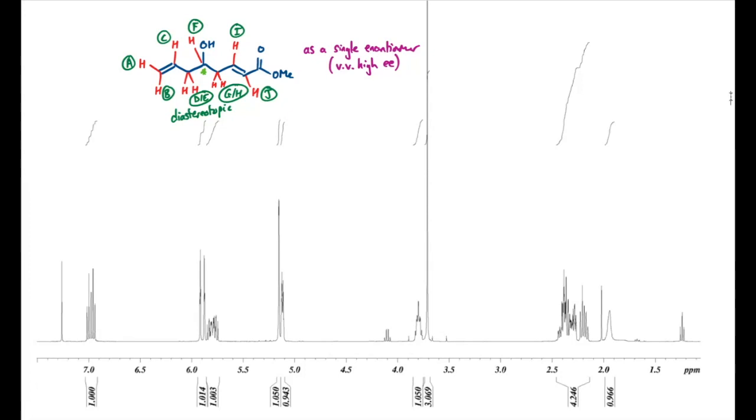Okay, so first things first, let's assign the spectrum of this alcohol just to get familiar with the peaks. It's important that we know that this spectrum was taken in deuterated chloroform as the solvent. So we can see the residual solvent peak here, which we could just use to calibrate the spectrum. It looks like former me was being a little bit lazy, and we can see a few peaks here, just with the arrows. This is some residual ethyl acetate that probably comes from the workup procedure, which I haven't removed fully on my HIVAC line. So I can just ignore these peaks. And in fact, we can largely solve this structure just by looking at the delta values.